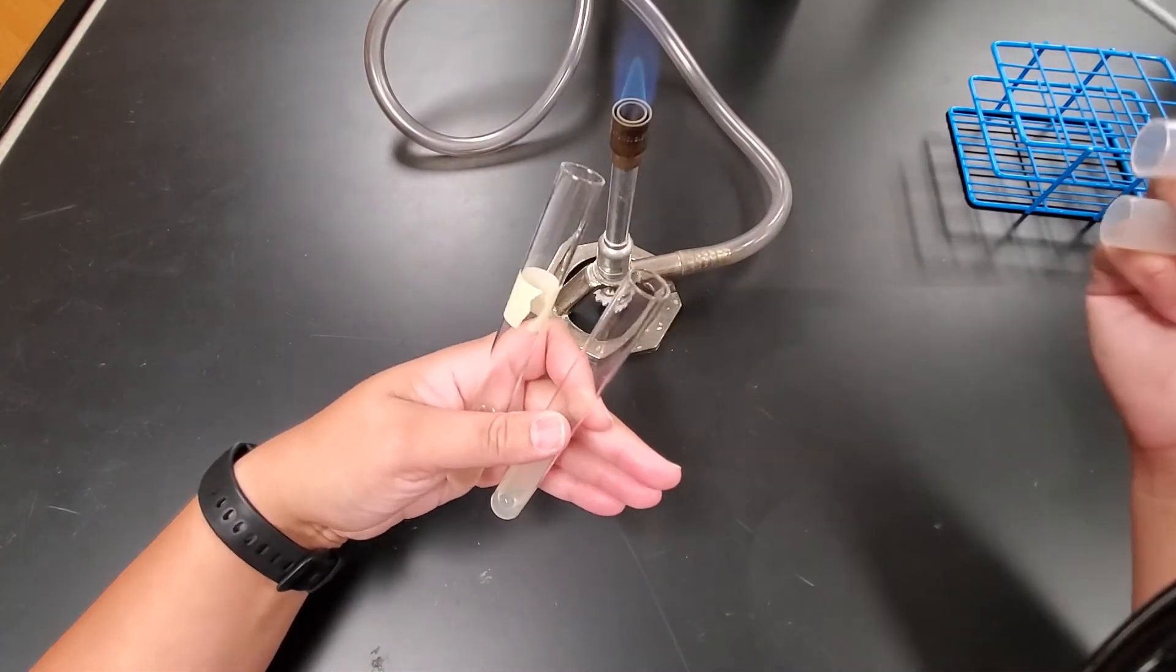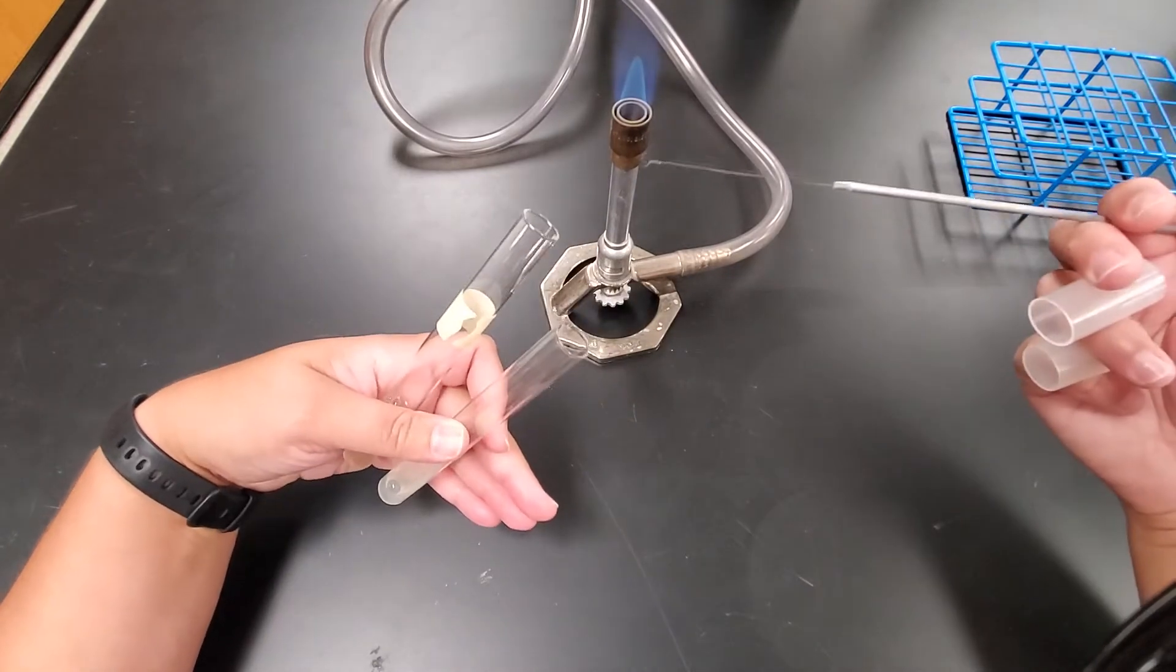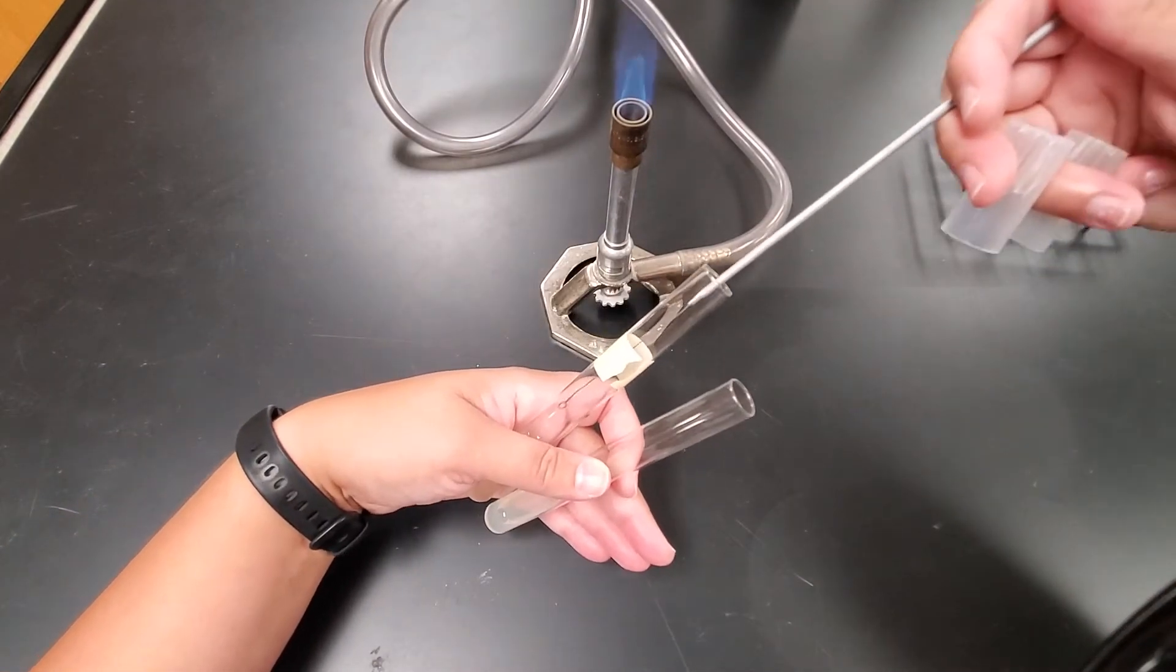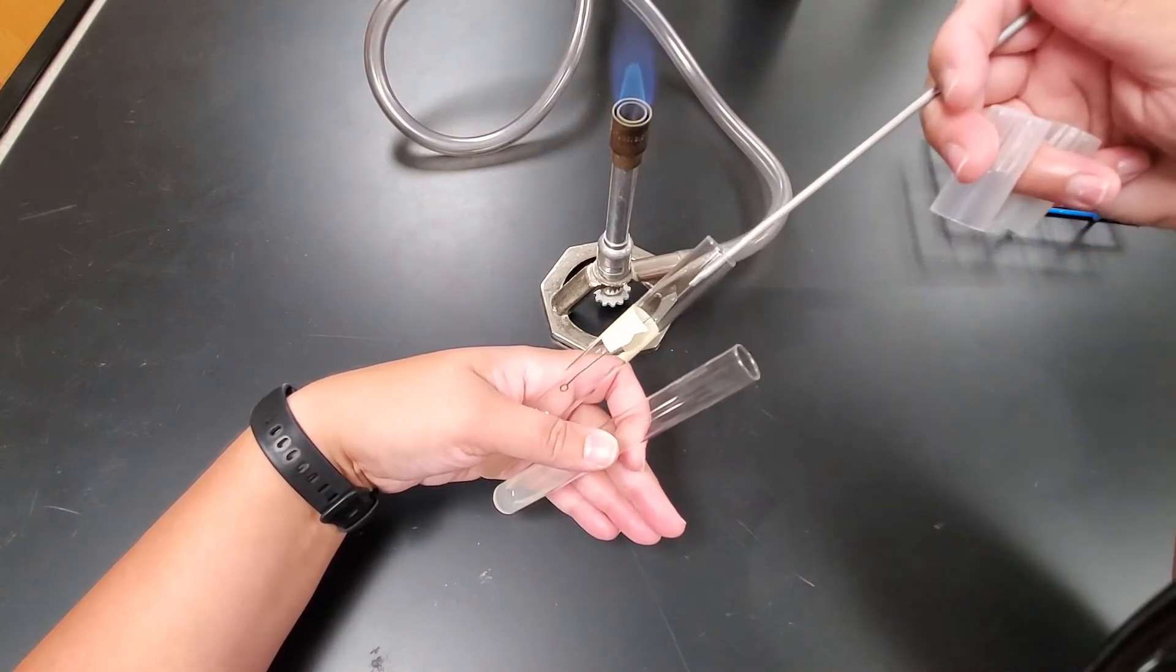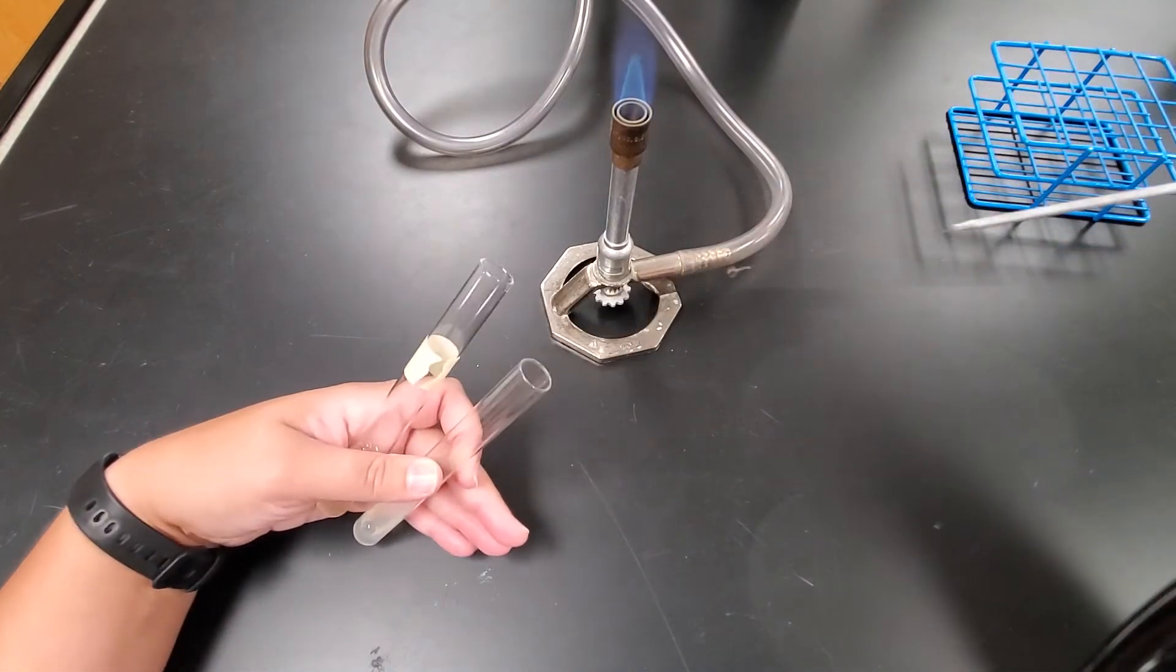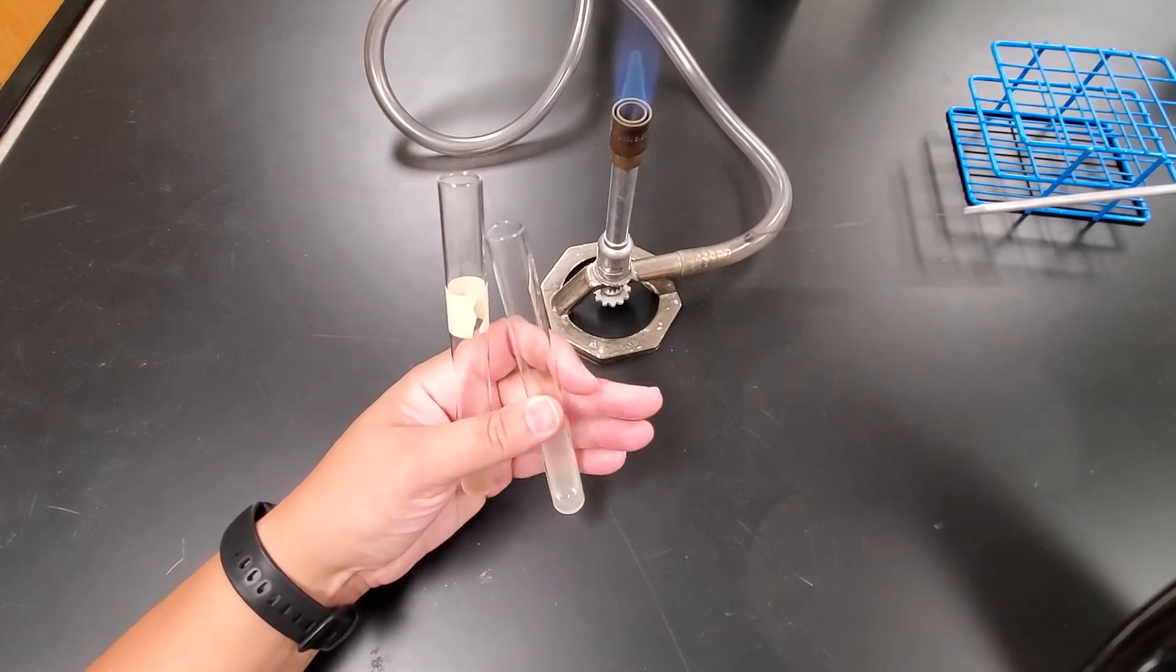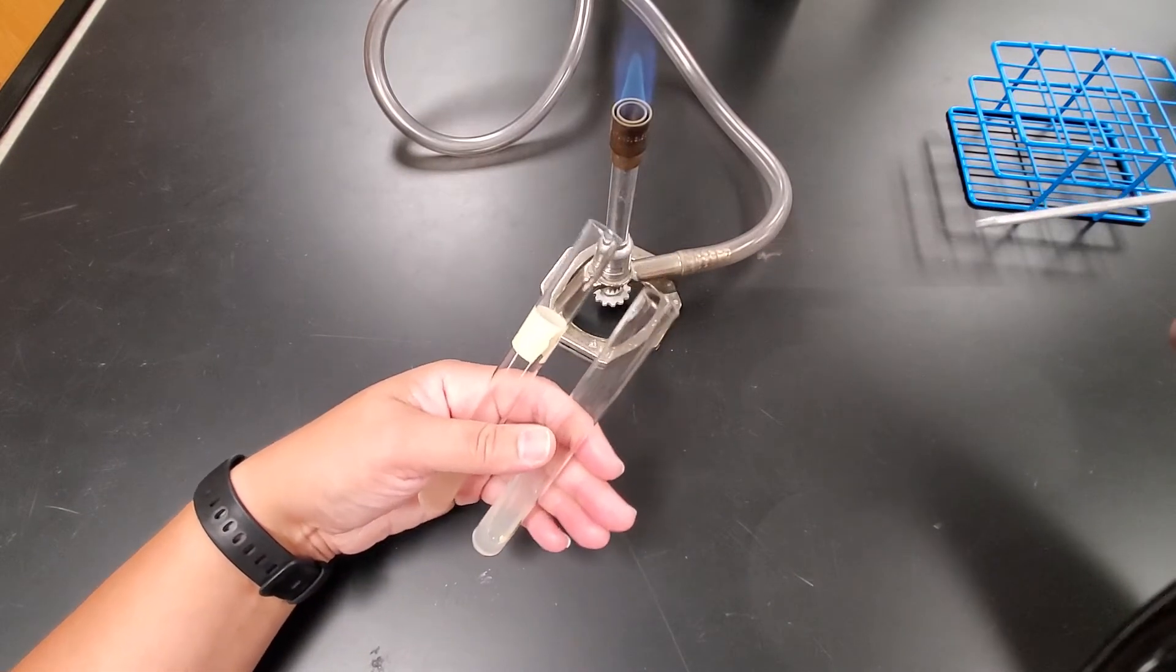So now my loop has been flamed. That's probably cool by now. So all I need to do is just go in there and grab a small sample. And what I mean by small sample, there's going to be a little bit of a shimmer on that. That's indicating that I've got now that sample.